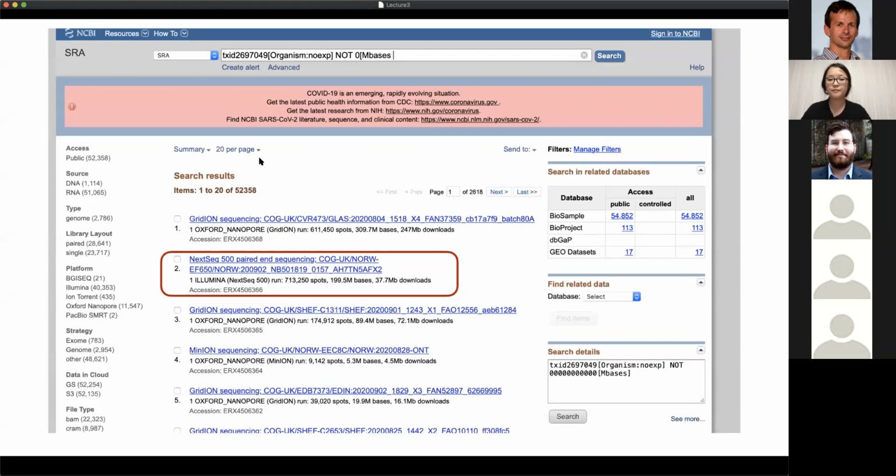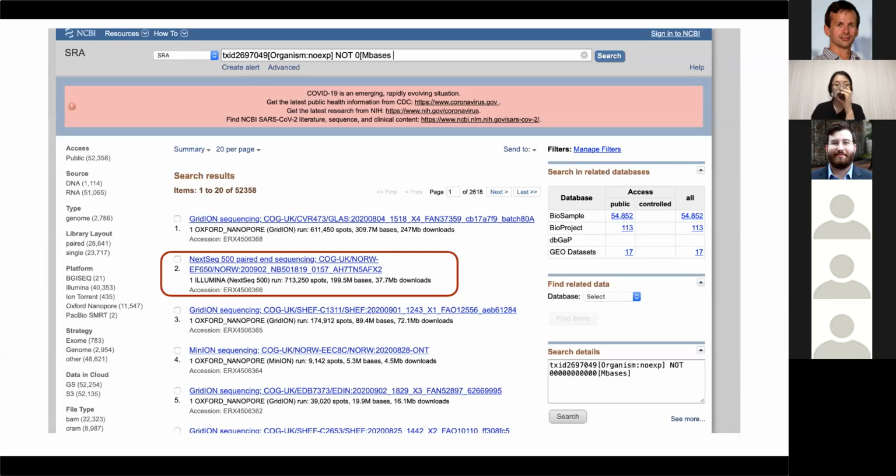And for example, you can see what these things look like. There is a database that is maintained by NCBI. It's called SRA, which stands for Sequence Read Archive. It is basically a companion database to GenBank, which stores more traditional assembled genomes or sequences that represent full genes or full organisms, but more generally just generated with older techniques. The Short Read Archive is a special large volume database that stores these next generation large sequencing runs.